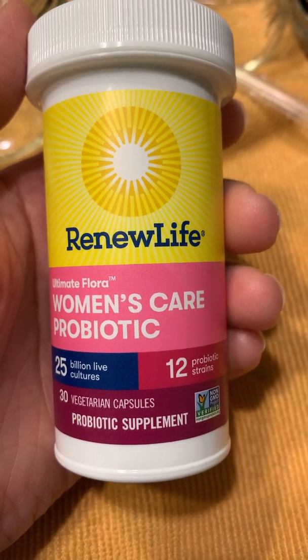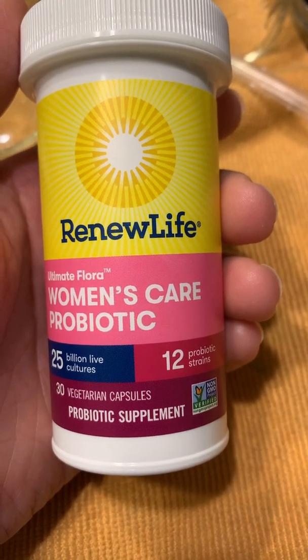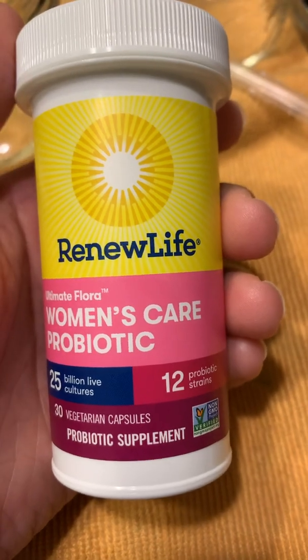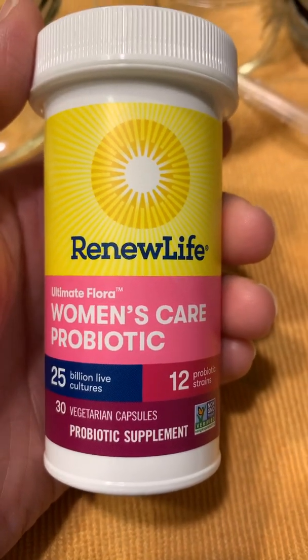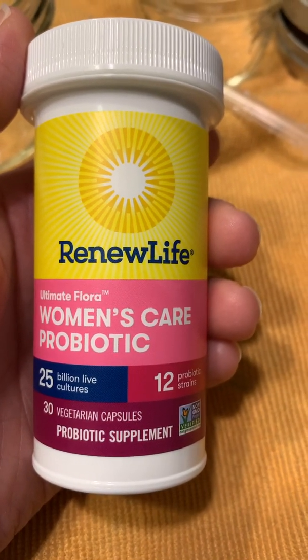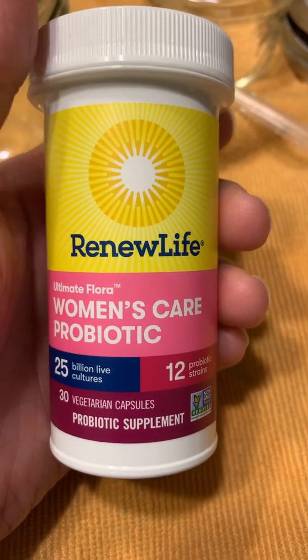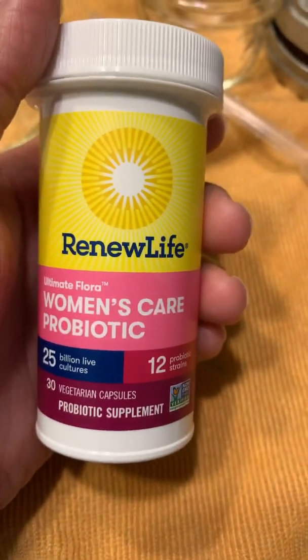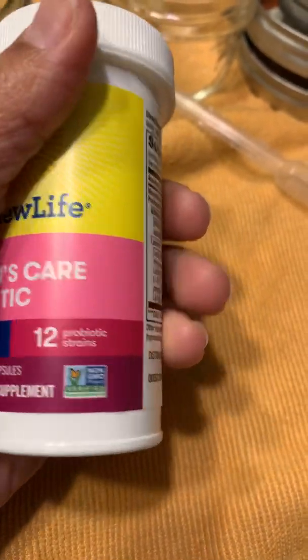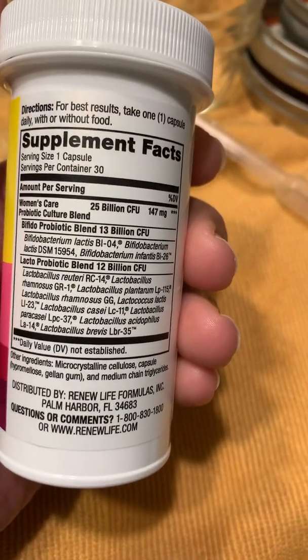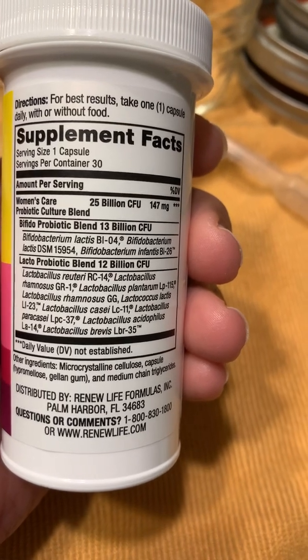Okay guys, today on this episode of Is It Alive, we are testing Renew Life Women's Care Probiotic and I'm going to show you what I see under the microscope if this is truly what they say it is. So here's what they say it is.